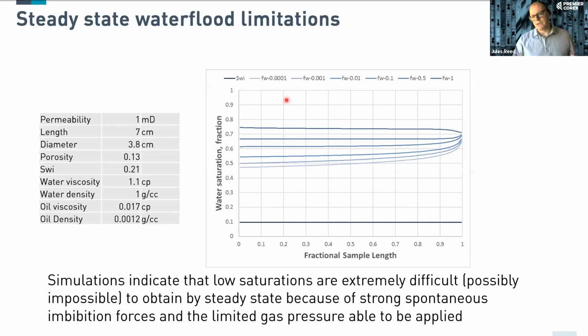And you have to begin to go, so the fractional flow of this curve here, this is simulated, was 0.0001. That would take about 7 days to obtain that one stage of the curve, and then each of these take less than a day to perform. But because the injection here is so slow, and it's the only way of getting these early fractions, to go any slower than this, you would be looking at 1 month for one step, and that's just impractical.